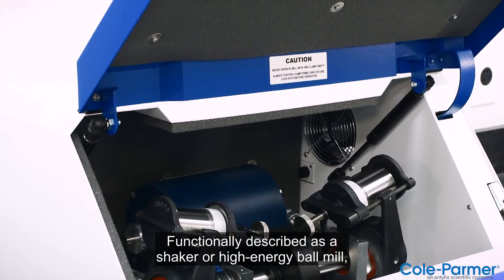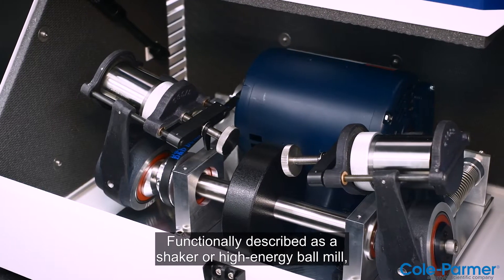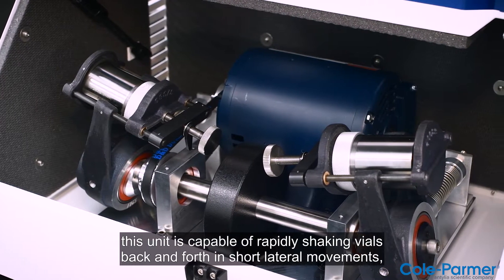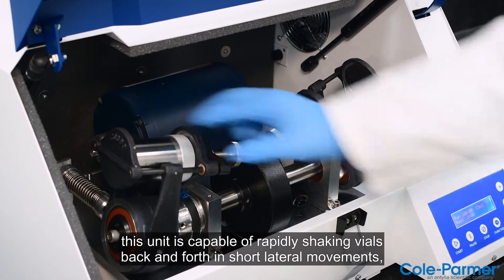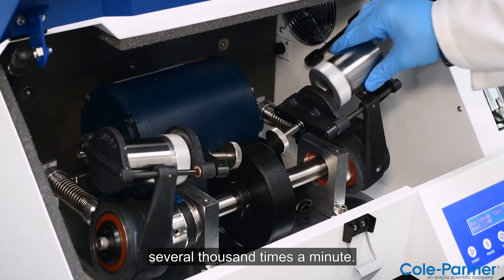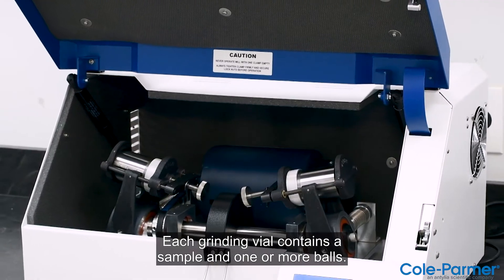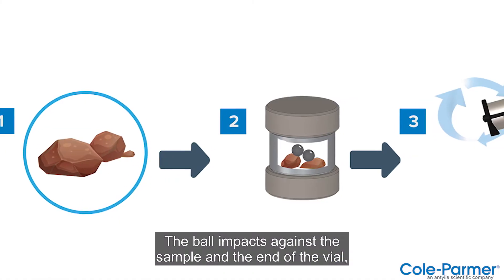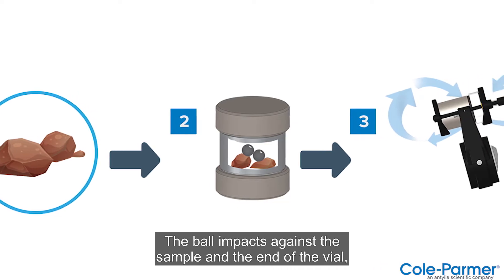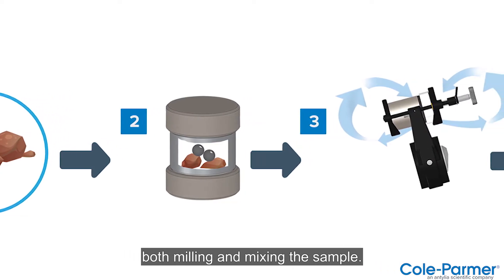Functionally described as a shaker or high-energy ball mill, this unit is capable of rapidly shaking vials back and forth in short lateral movements several thousand times a minute. Each grinding vial contains a sample and one or more balls. The ball impacts against the sample and the end of the vial, both milling and mixing the sample.